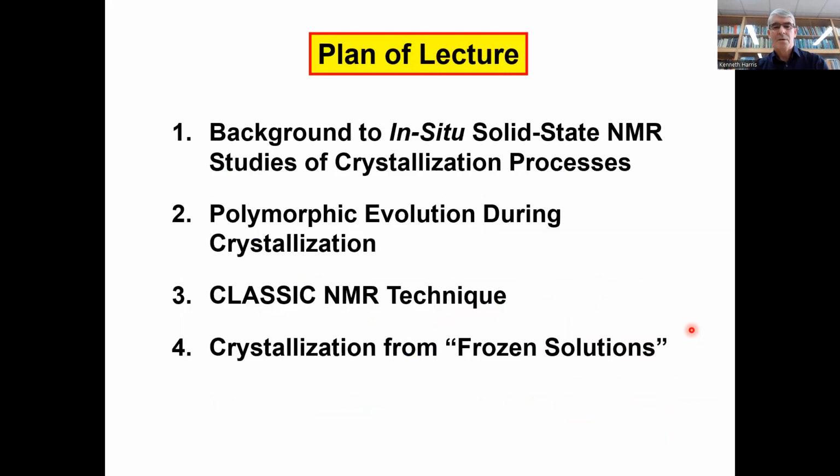So what I'd like to do is, I hope I've convinced you that in-situ NMR studies have a lot to offer in terms of studying crystallization processes, both to monitor the evolution of the solid phase, but also via the classic NMR technique to allow us simultaneously to study the evolution of the liquid phase. We've seen crystallization from solution, from the liquid phase, from frozen solutions, and also the use of these techniques to study kinetics of crystallization.